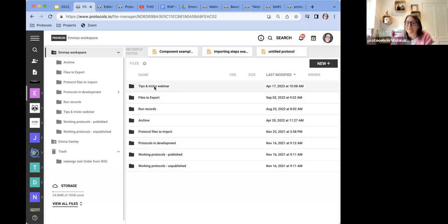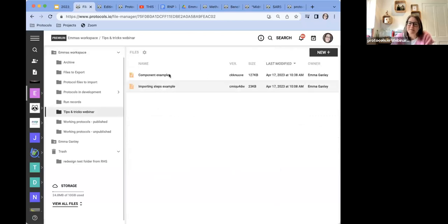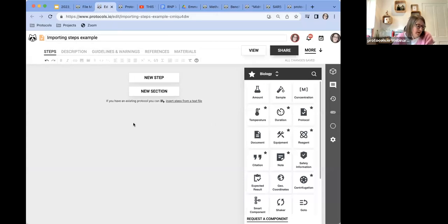I've got a folder for this webinar, but you can also have files you want to export, run records, different levels for the protocols, ones you want to import you've not done yet, some in development, published ones, unpublished that are working and fully done. I'm in this one today. I've got a couple of things I'll run through with you. So this is workspace view. And then if you open one of these protocols, you will come into the editor.